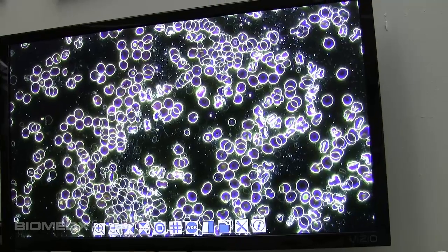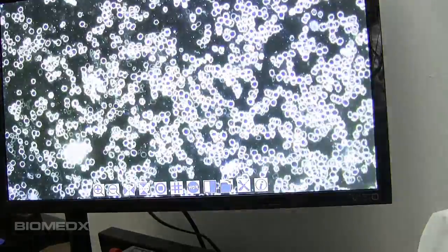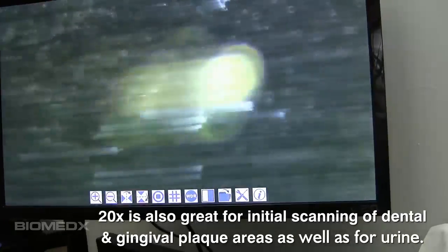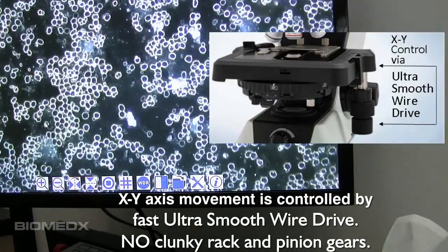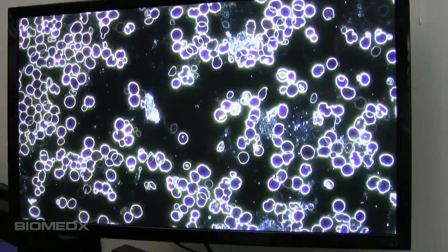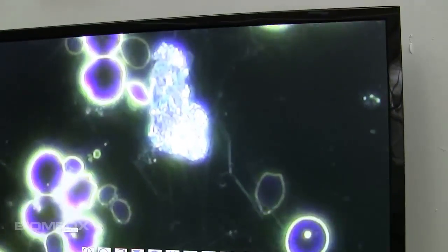You can have a very wide field of view if you want to scan. You can come down here and flip it to the 20x objective — 20x gives you a very wide field of view. So you can scan from one side to the other side of a slide, up and down, back and forth if you're looking for something in particular, find something, then flip it to the 40x mode and zoom in.